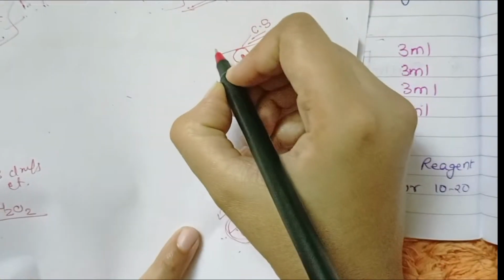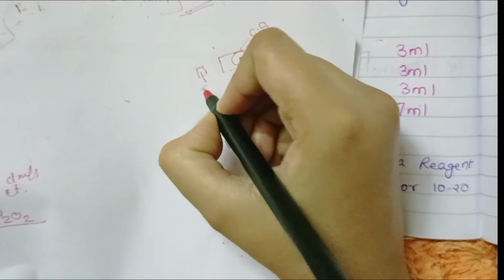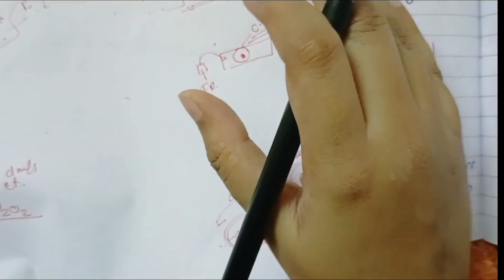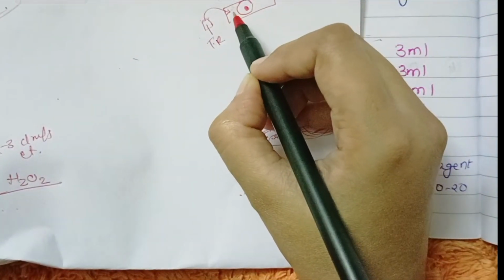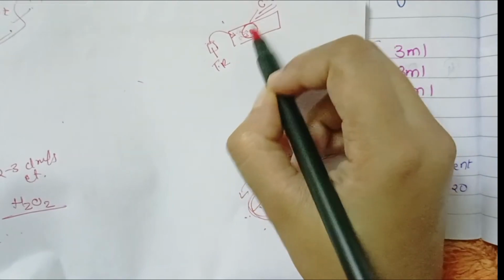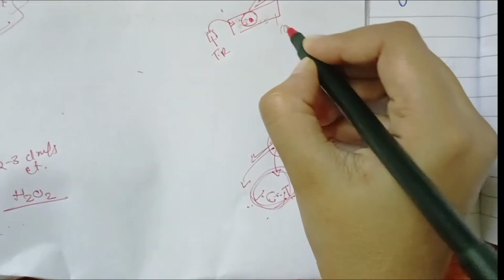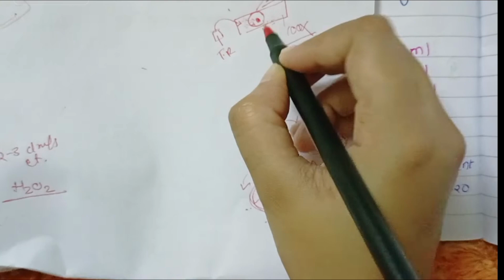Now put this prepared Takayama reagent and allow it to slip through the slide, through the cover slip, and let it cool. After a while you can observe it under 100x.